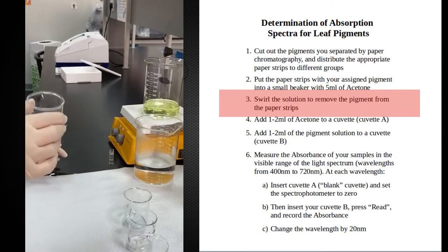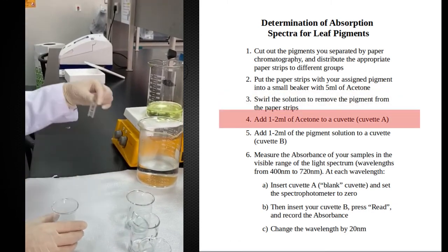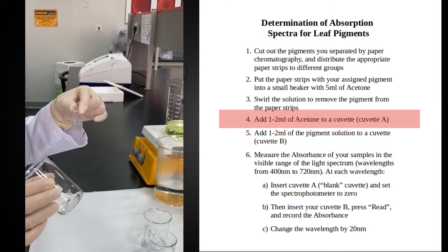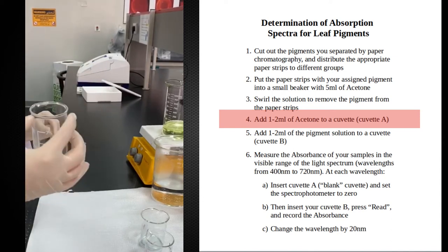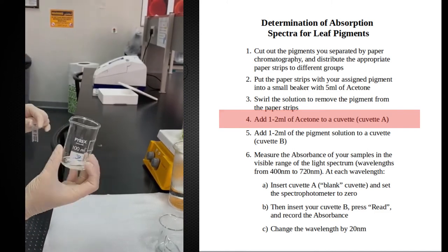Probably I can start with the chlorophyll A. For this measurement, I need a cuvette of acetone as a blank. Why acetone? Because I have dissolved the color in acetone. So this cuvette, I'm going to use it as a blank and I'm going to measure the absorbance of light of chlorophyll A at a different wavelength.